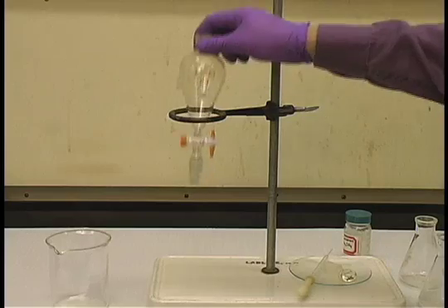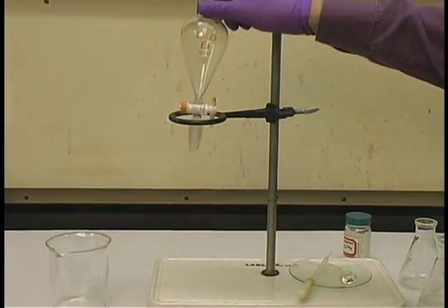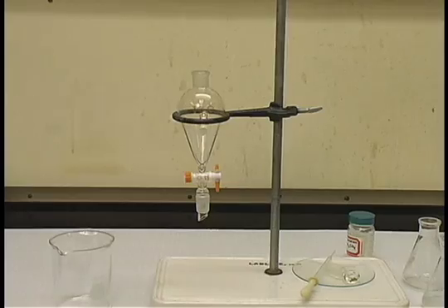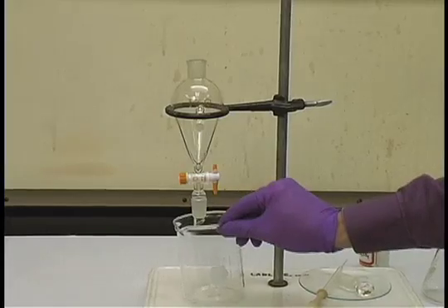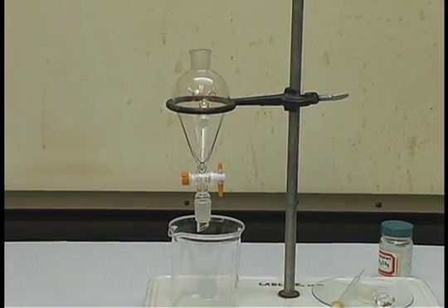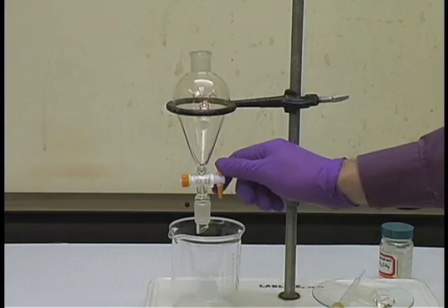In a liquid-liquid extraction using a separatory funnel, you first place the funnel in a ring stand, and then underneath the funnel, you place a beaker. This beaker serves as a catch basin in the event that you leave the stopcock open.